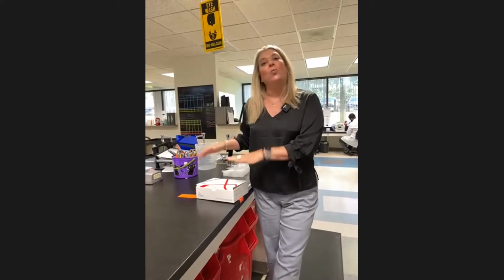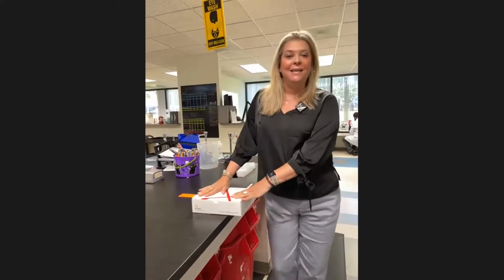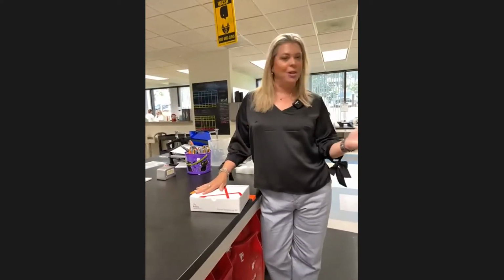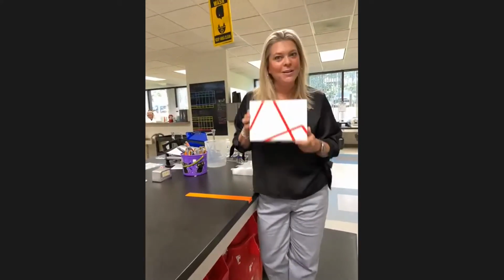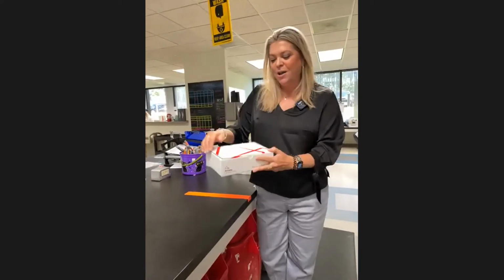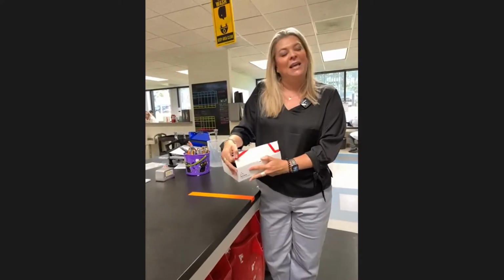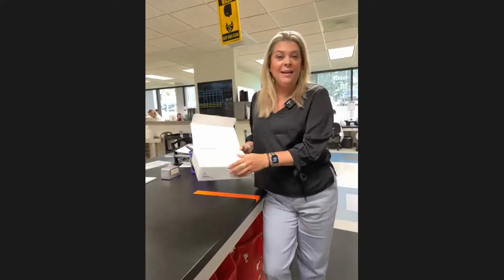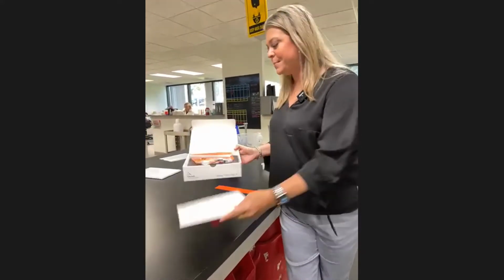So we start by sending kits out to our hospitals. These are kept in hospitals that use our service all across the country. And so here's what one of the kit boxes looks like. We send these out ahead of time, and they keep them on hand there in the hospital. Inside is everything they need for sending your biopsy to us.